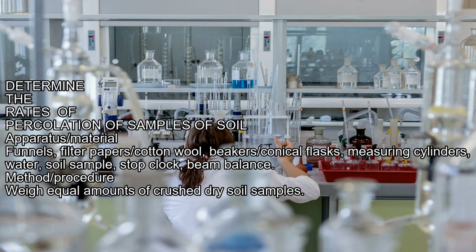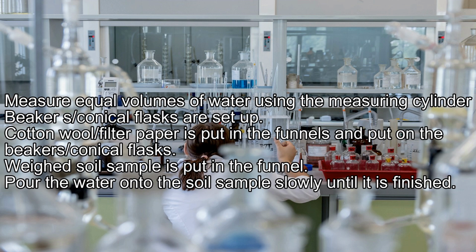Apparatus/materials: funnels, filter paper/cotton wool, beakers/conical flasks, measuring cylinders, water, soil sample, stop clock, beam balance. Method/procedure: weigh equal amounts of crushed dry soil samples. Measure equal volumes of water using the measuring cylinder.